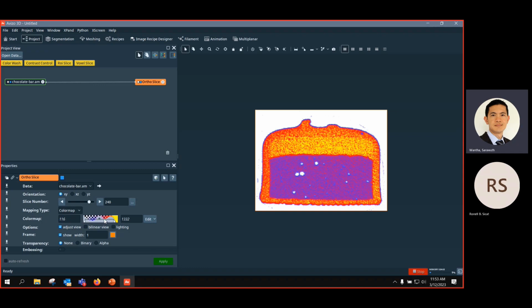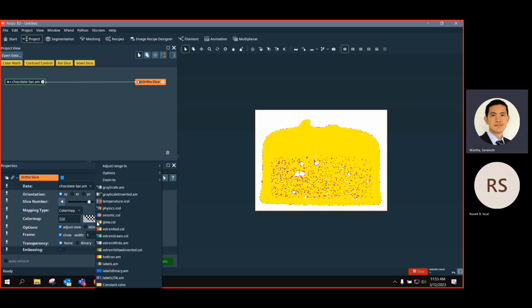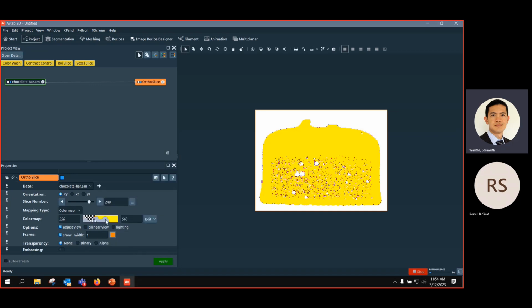Sometimes when you look at the dynamic range and your range becomes very, very small, like if you adjust it like here, you can see that the range is pretty small and it's difficult to move anymore. What you can do is zoom to the range. So you can right click, and then zoom to this range, and you can see this range has been zoomed back to the range that you are focusing on. Or you can just right click again and then zoom to data min max. So it will just zoom to this histogram. Just in case sometimes you have a really short dynamic range of the histogram, you can just use this zoom to range as well.